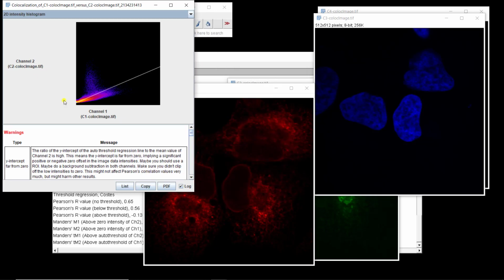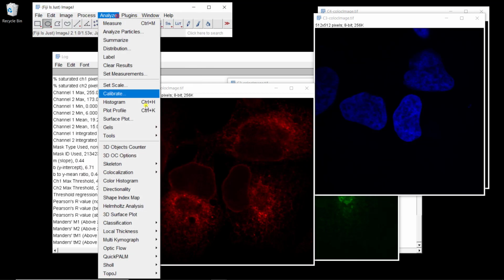Oh, sorry, I didn't change. So here I did it between C1 and C2, you see, and I want to do it between C1 and C3. Don't go too fast. When you have several channels, you need to be careful.